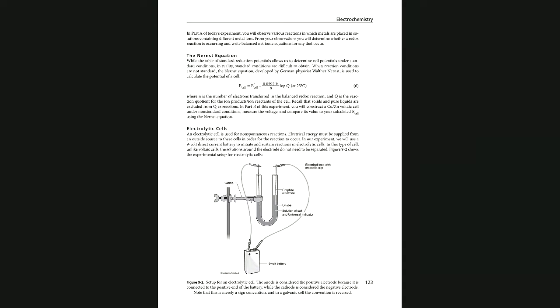When you read the manual, it gives you the choices. For sodium chloride, it gives you choices, and you look for evidence for either oxidation or reduction. If one is oxidized, the other one is going to be reduced.